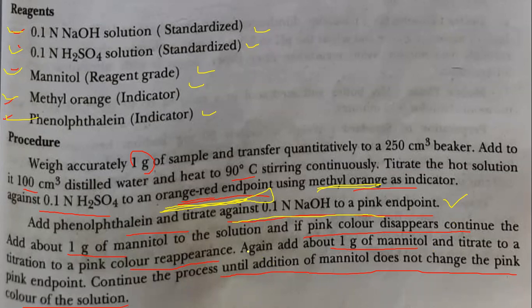Again the pink color reappears. What happens? You have to continue. See, I'm going through the sentence. Again add 1 gram of mannitol and titrate to a pink end point. Continue the process until the addition of mannitol does not change the pink color of the solution.